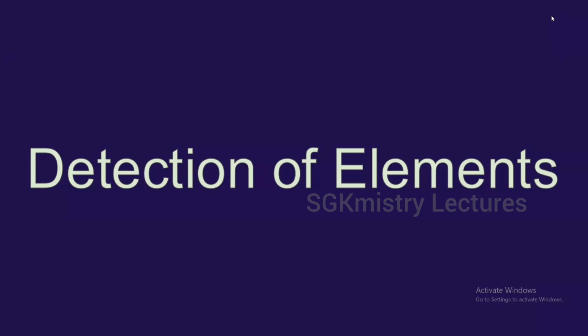All these are very important. Based on that, you'll be getting an idea about what is the group to which the compound is belonging to. And from there, after performing the functional group analysis, you'll be getting an idea about what is that given compound. And then only you can go for the determination of the boiling point or the melting point.